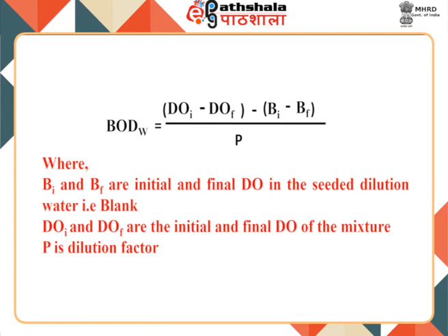The change in DO in the bottle containing just seeded dilution water, which is called the blank, as well as the change in the DO in the mixture is then noted, and using this equation the BOD of the wastewater is then calculated.